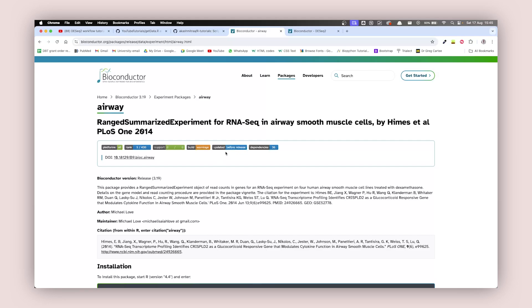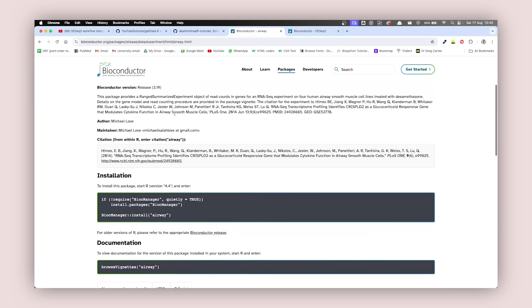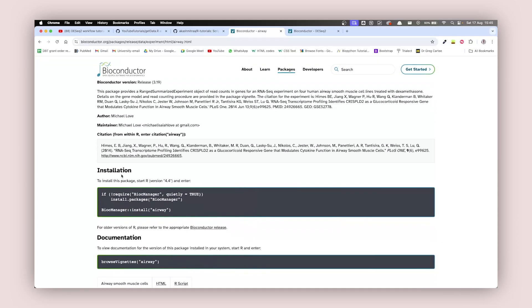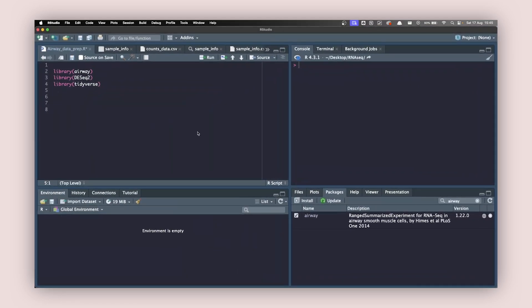Click on the first link and you're going to land on this page. Airway is part of the Bioconductor package and you need to install it first. It is for RNA-seq and airway smooth muscle cells. Go down to the installation section, copy the command, go back to RStudio, paste it in the console, run it, and it will be installed in your system.